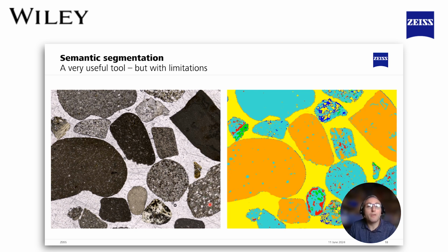But if we try to use semantic segmentation effectively on light, dark, and sort of medium colored minerals, we'd get an image like this on the right, which starts to give us a breakdown of that variation, but doesn't actually tell us the difference between the different lithologies. We can visually see that this clast that's mostly orange here is probably similar rock type to this one next to it.